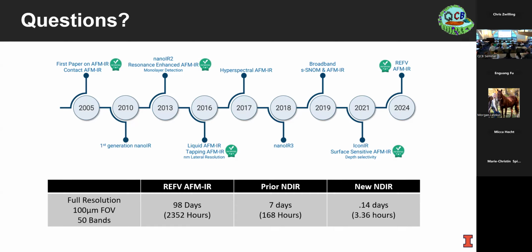You're right. We might. I think the original question that we wanted to probe was those things that you cannot label and measure inside a cell. We should be able to directly record. Sure. So obviously the wonderful thought experiment is if we could make the tip as sharp as one molecule, we'll basically be able to measure the spectrum of every molecule in the cell, right? Obviously, but that's not going to happen. So there's some finite volume that is practically measurable and practically deconvolvable in its IR spectrum to look at those things that we cannot label.